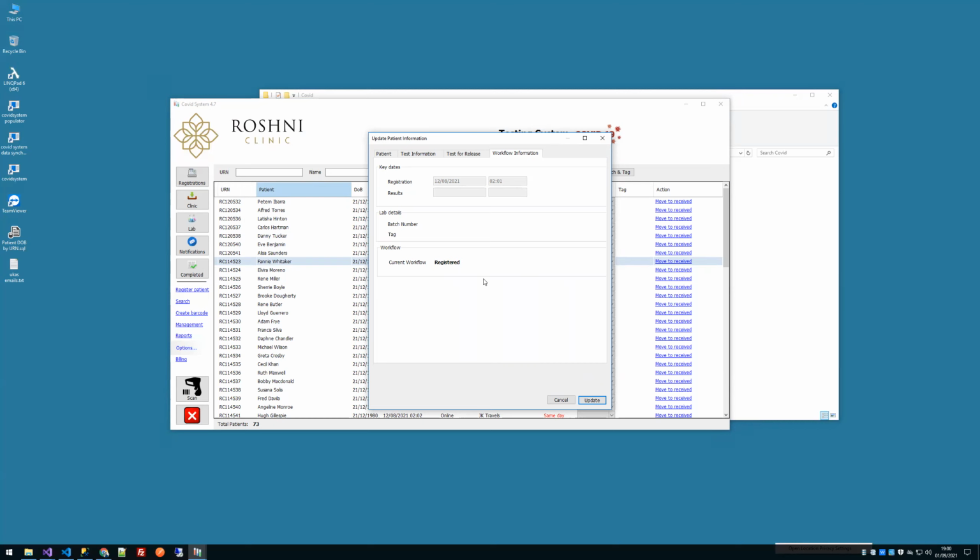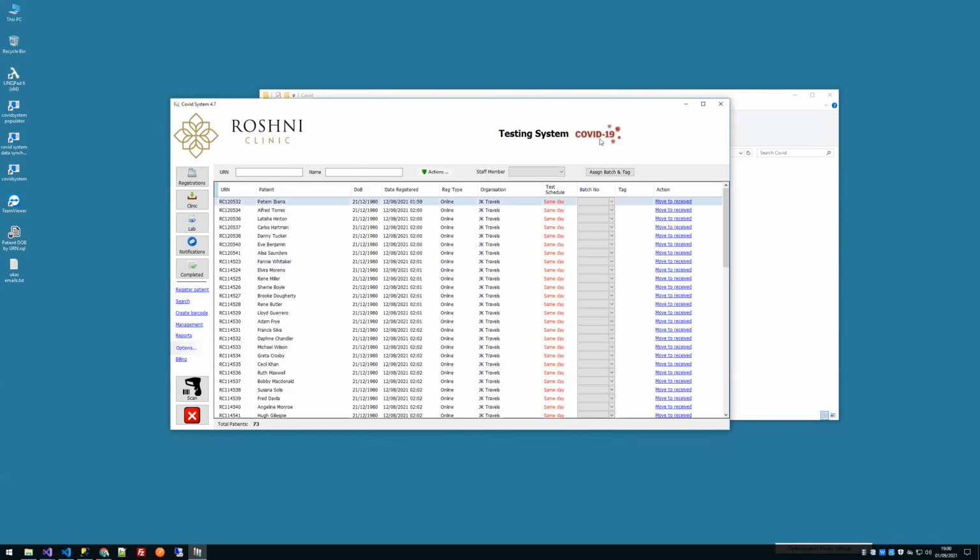It is audited. That's one of the key requirements for it to be PHE approved, to be honest. And when I went through that with the guys in the clinic, I said, this is what it is: it's there, but it's not on the front end. So I can view all the requests that have come into the website. But if the audit trail needs to be accessed and submitted, we would be able to do that. That's just another feature. This is an application that's running and being worked on whilst it's being used. The audit trail is just prioritization now, really.